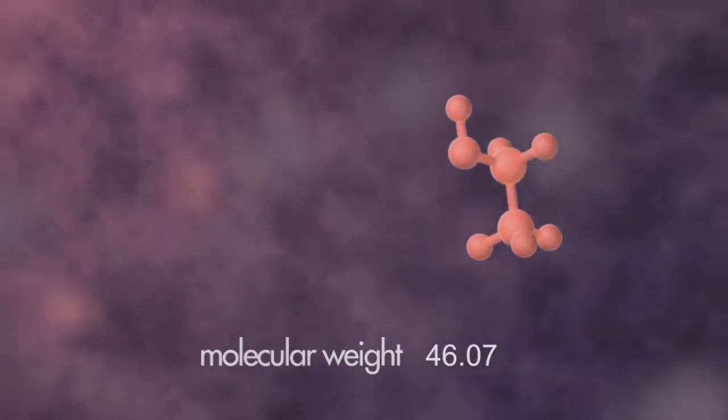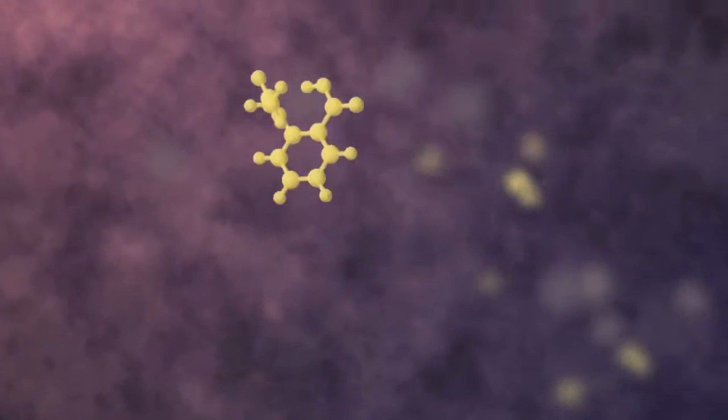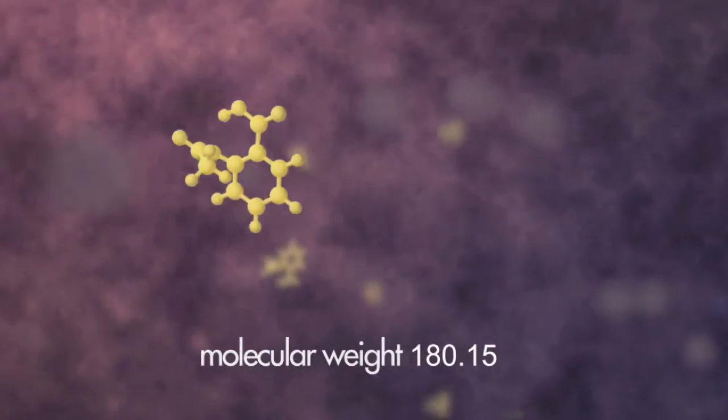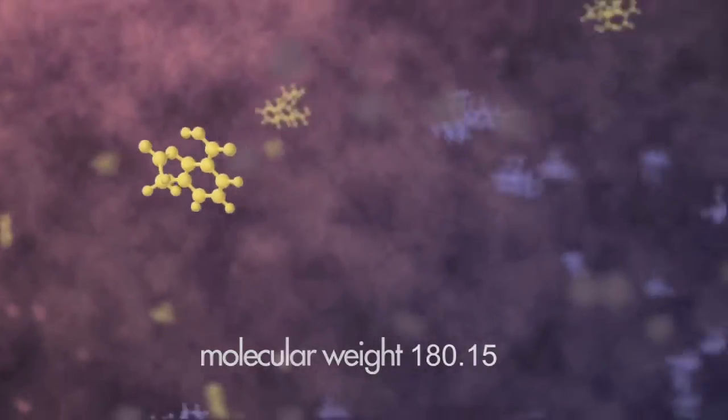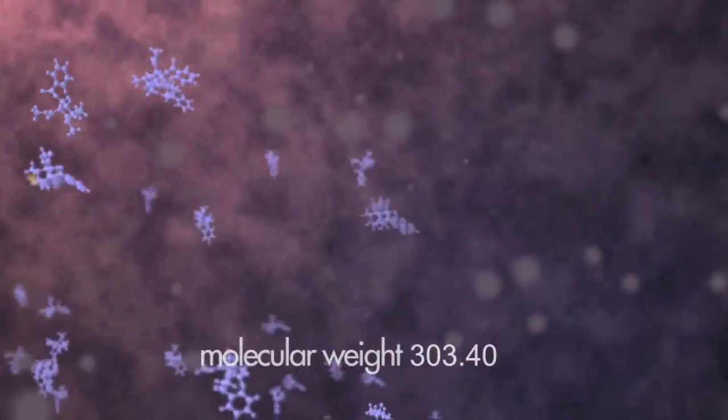Depending on their size and other properties, different compounds pass through the stationary phase at different rates, emerging from the column one by one.